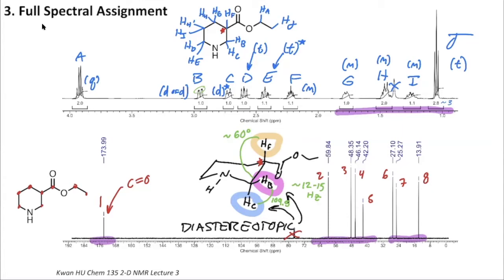So even if you don't have the exact numbers to hand, while you're working on these problems, particularly the post lab, you want to be thinking about different J values. You can ask yourself, do I have a big J? Do I have a small J? Perhaps all of my J's are equal? These might help give you some insight, whether from the forward direction where you say, I'm looking at peak B and I see what looks like a doublet, but with some complex splitting, could be a doublet of doublets. That might mean big J, small j.